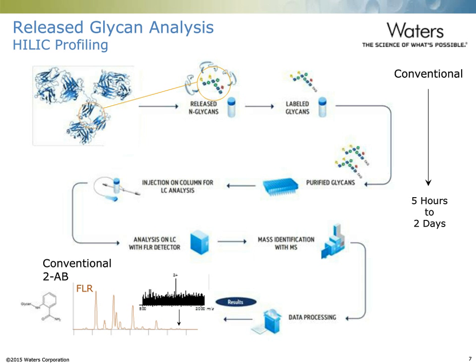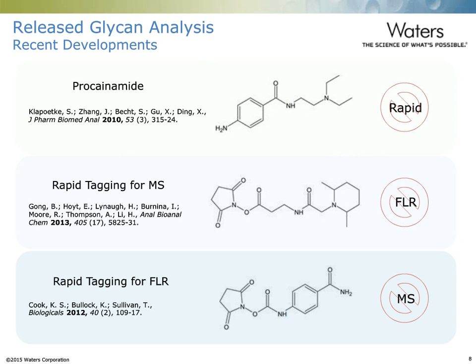Variations to conventional approaches for N-glycan sample preparation have been explored, but have not as of yet presented a practical solution that combines the desired attributes of simplicity, high sensitivity, and high throughput. Alternative labeling reagents, for example, procainamide, that have functional groups to enhance electrospray ionization efficiency have been used, but this does not address the cumbersome, time-consuming nature of reductive amination reactions.